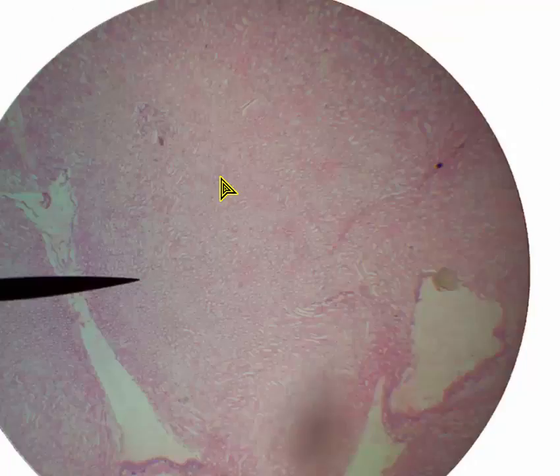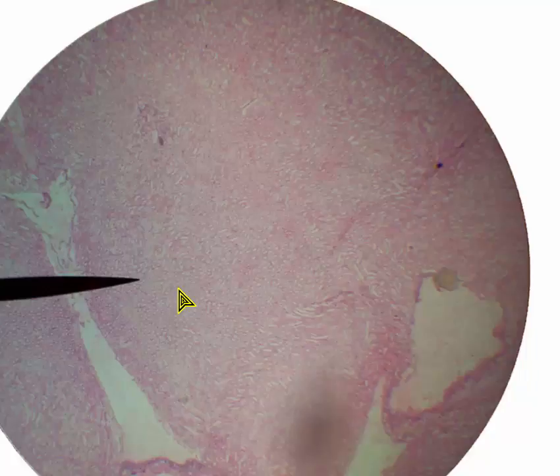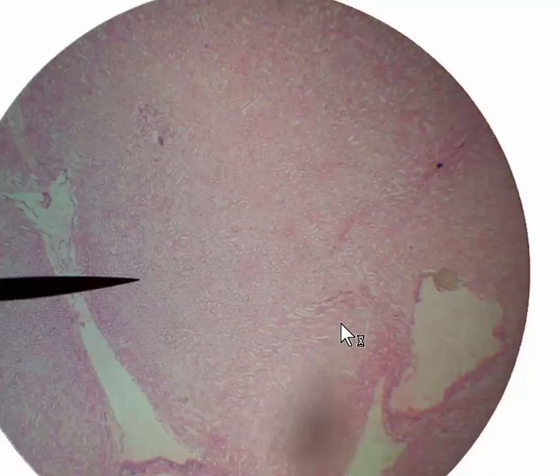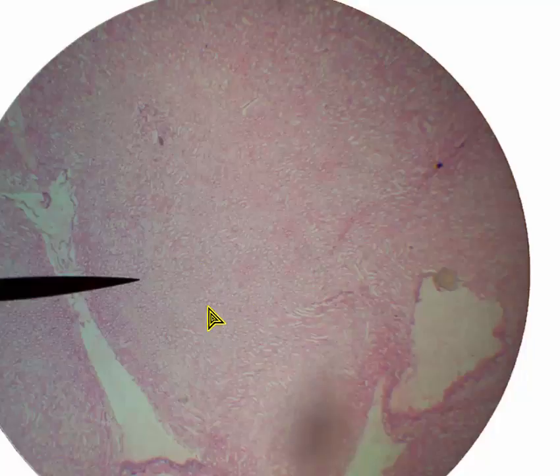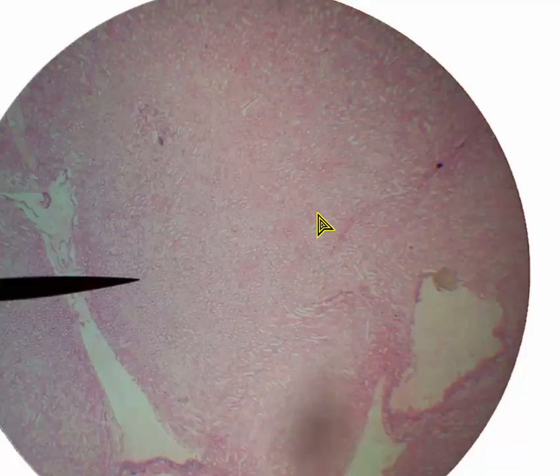This is also mouse kidney at 40 times magnification. I thought it was kind of neat that it appears we're seeing a pyramid. This looks like the pyramid coming down to a point here, and again this would be the medullary region. Looking way up top, I can't for sure see any corpuscles, so everything in view may be renal medulla.